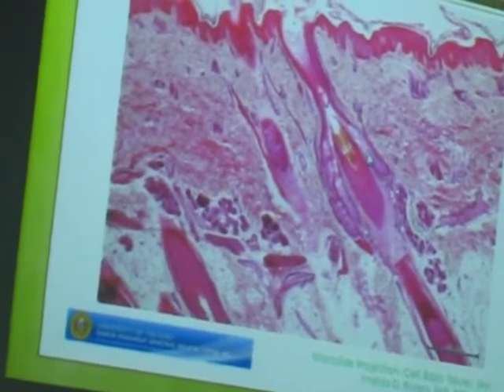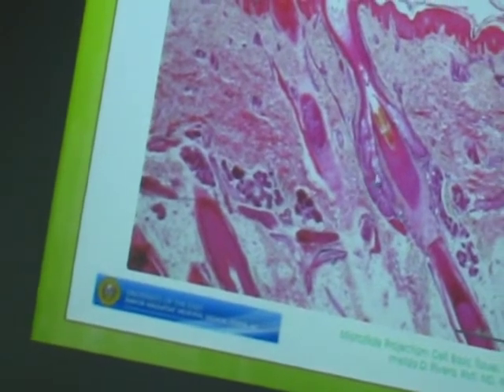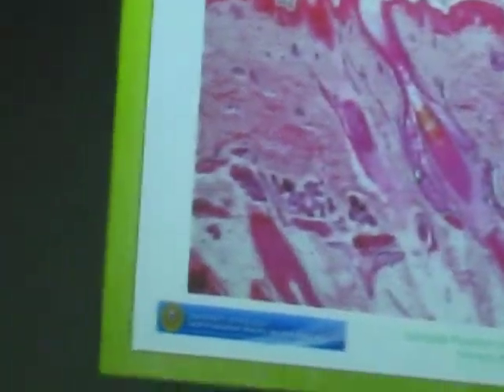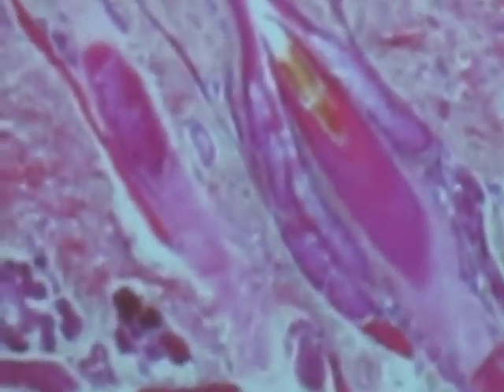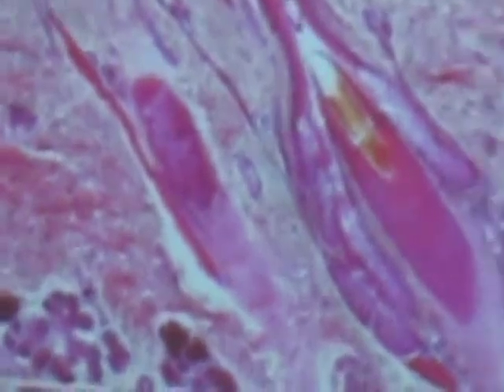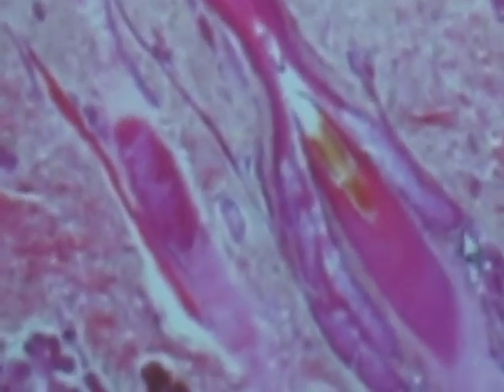Identify pointed structure. Sebaceous gland. Classify pointed gland according to morphology. Simple, branched. Simple, you have one duct, this is the opening, together with the hair shaft. Simple, branched, acinar.